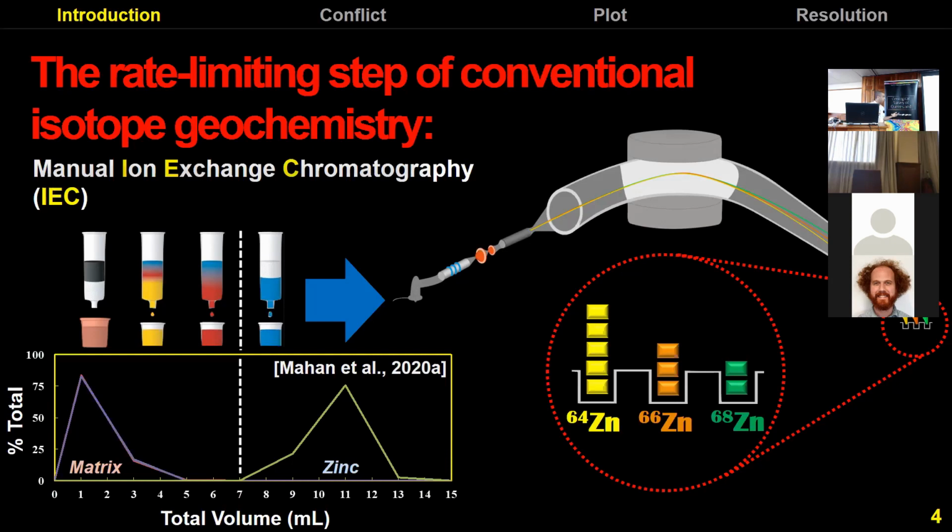So then basically what you want in the best case scenario is this nice strong peak where you're pulling everything off in one go. You can actually cause fractionation of the isotopes on the columns. So we also need to, in general anyways, make sure that we're getting about 100% yield. So you need to be extracting everything off of there. And then again, as I said, sometimes there's a bit more prep involved, but then we can put that into solution and run it through our instrument.